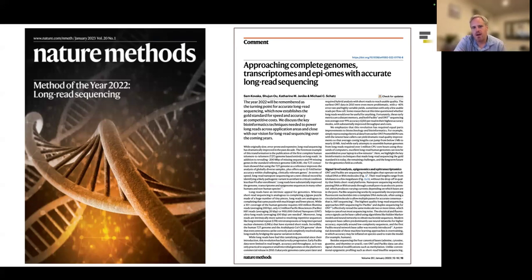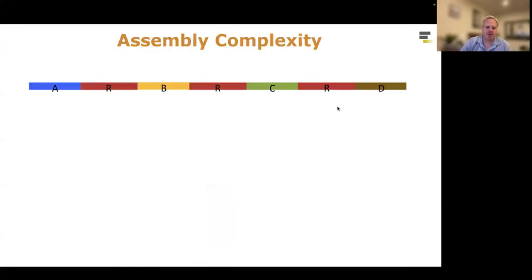2022 was specifically a milestone year because this is when the telomere-to-telomere human reference genome was first assembled and published, where we had a complete representation of a human genome for the first time. It was just an incredible achievement. But that's just one example of the quality that we're getting. Now many different plants, animals, fungi and beyond have telomere-to-telomere representations, largely driven by improvements in long read sequencing. So what's so special about long reads?